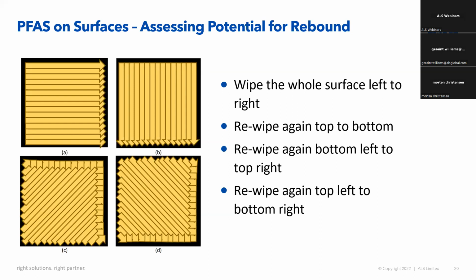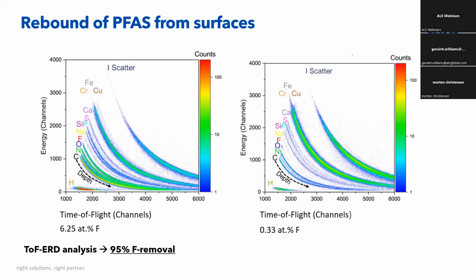You could upscale that, and you get an indication of the PFAS residual on the entire surface of the tank by upscaling that approach. Because we're able to work quite closely with our academic partners, it provided verification of the approach that we took. So I just wanted to draw your attention to this particular analytical technique that allowed us to verify this approach. It's a technique called time of flight elastic recoil detection analysis.